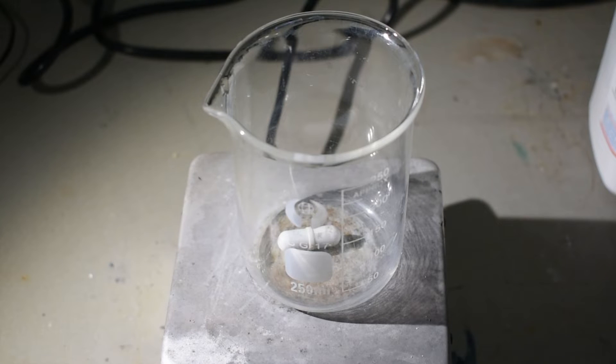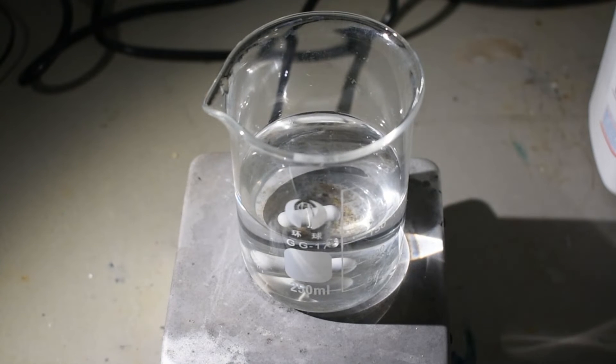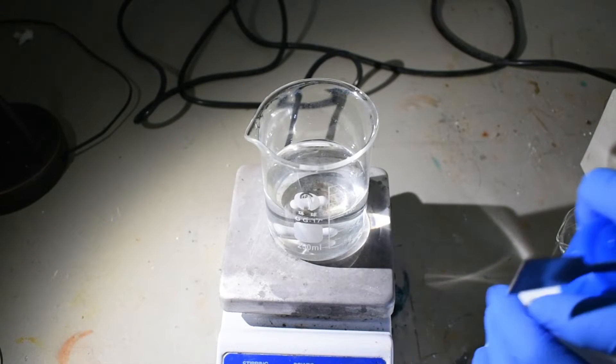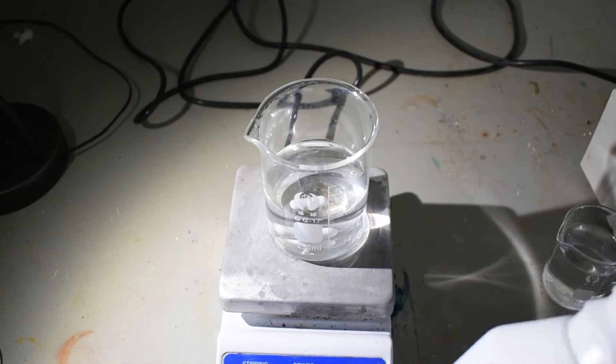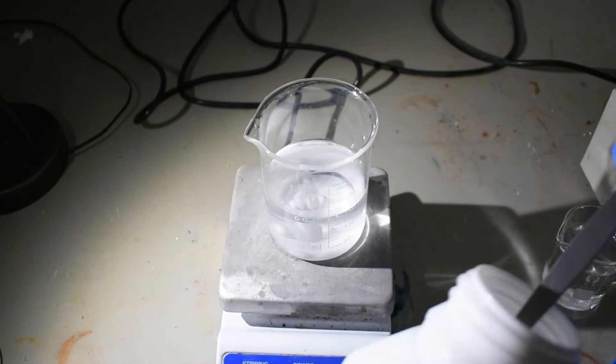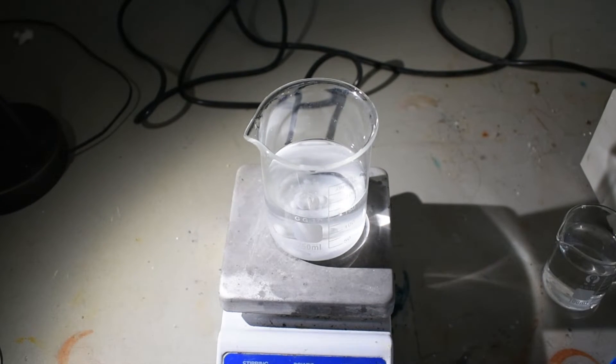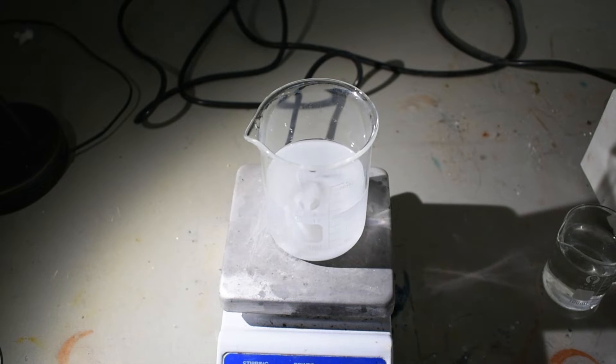First, I'm going to measure out about 150 mils of distilled water. And then to that, with stirring, I'm going to add a few scoops of solid barium nitrate. And I will dissolve this with stirring. This might take a little while, and may require a small amount of additional heating.